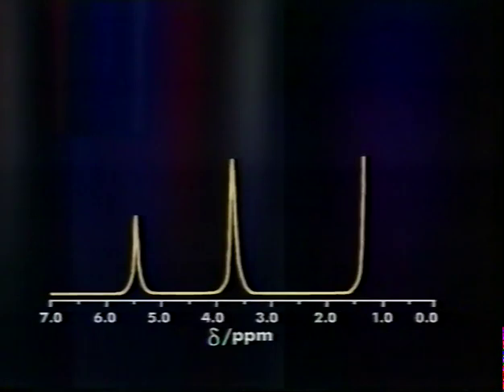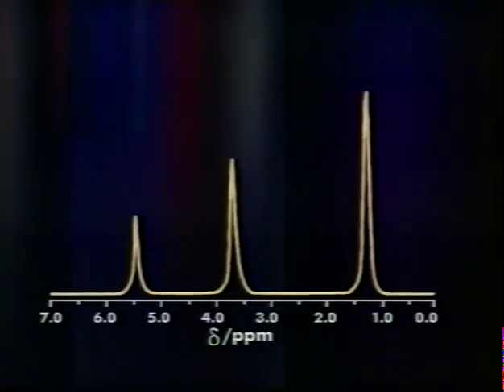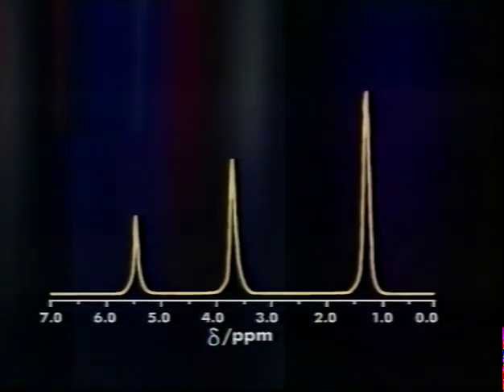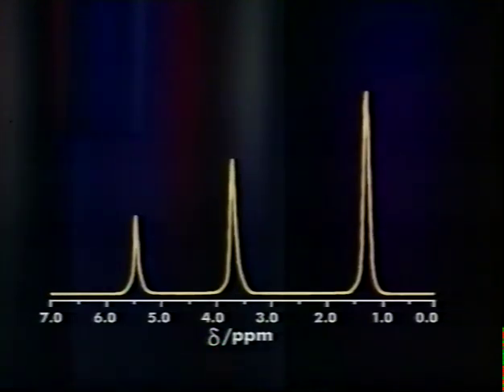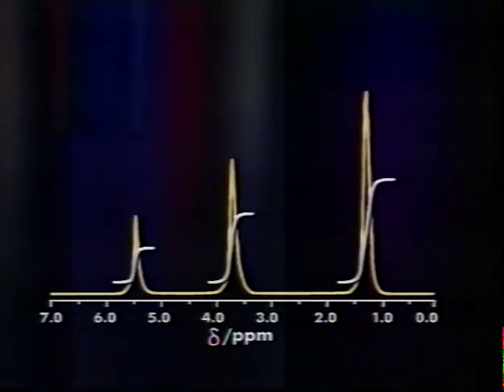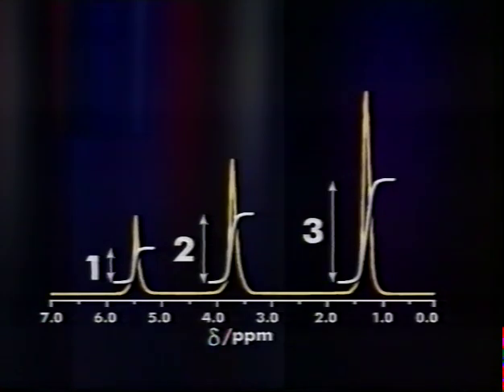There are four important aspects of NMR spectra which provide valuable information about chemical structure. The number of peaks, or absorptions, indicates how many different kinds of chemical environments are present. That is, how many different kinds of non-equivalent protons there are. By integration of the areas under these peaks, we can allocate the proportion of protons that are associated with each peak.